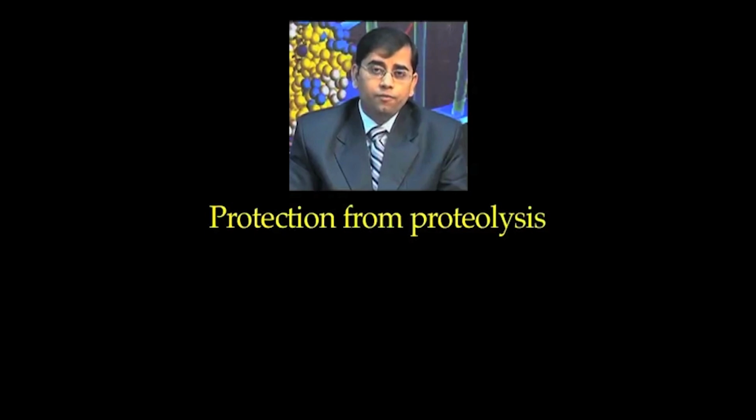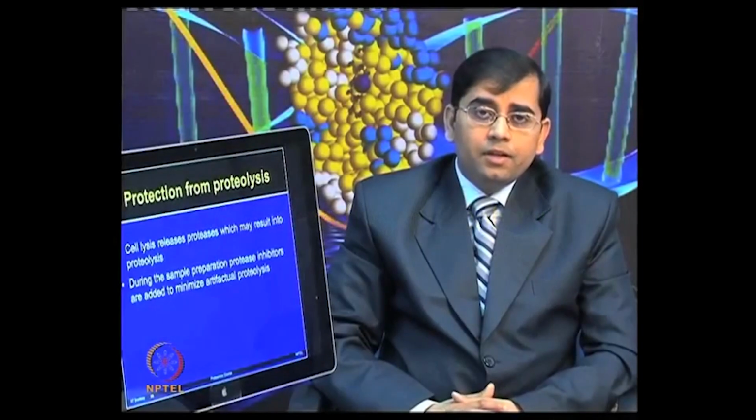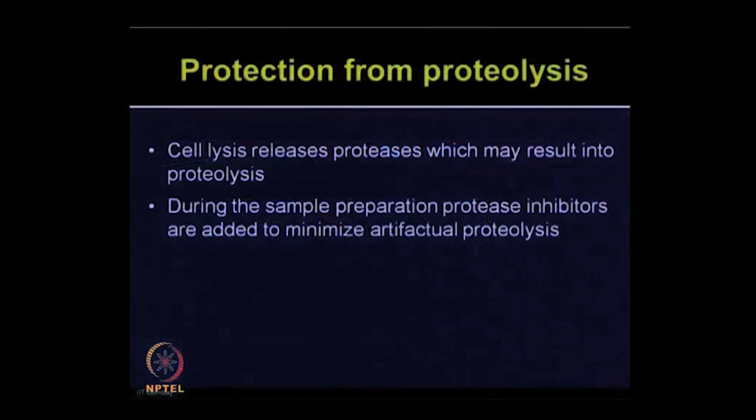So, protection of your protein components from proteolysis is very important during protein sample preparation. Cell lysis will release various proteases which may result in proteolysis. During the sample preparation, one can use different types of protease inhibitors which can minimize the artifactual proteolysis.